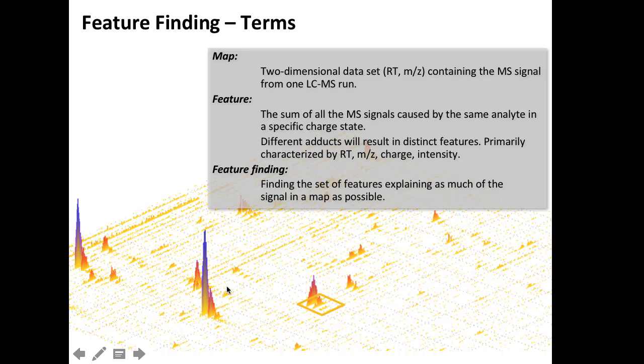They should be co-eluting, because they're basically the same thing, but they have different masses because in one case there's a sodium ion sticking to it, in another case there's an ammonium ion sticking to it. And if you want to figure out the concentration of your analyte, then you of course need to sum them up, and that is already another problem.